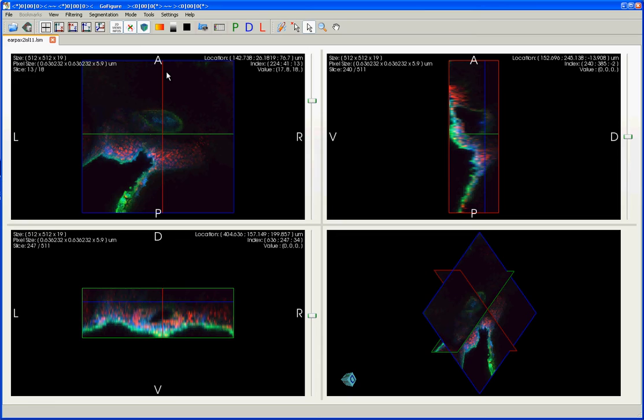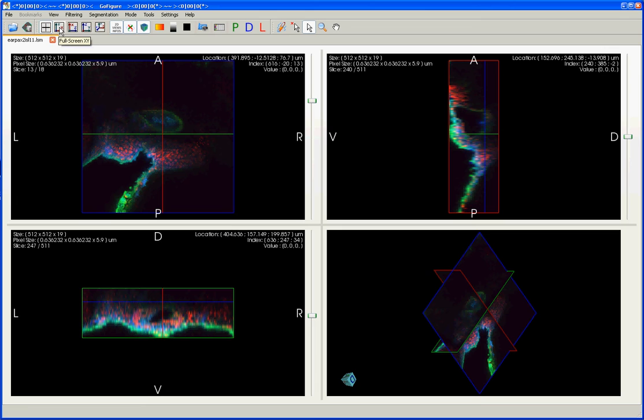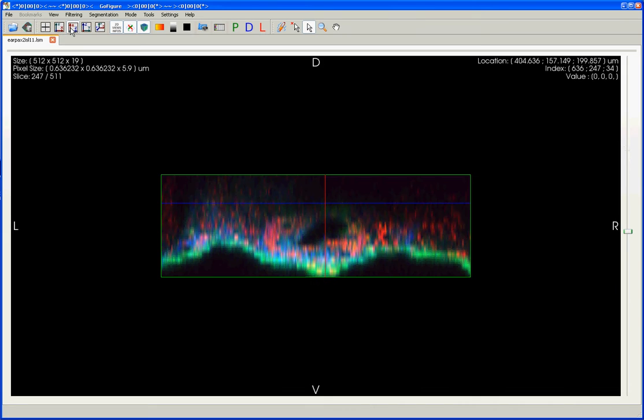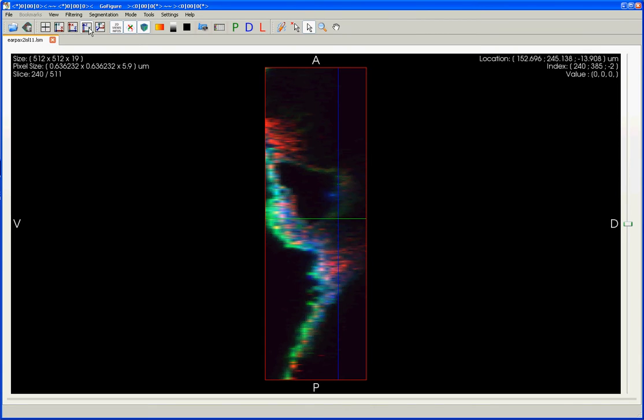While I often find it useful to navigate through my images in this quad view, depending on what feature you might want to focus on, it's sometimes useful to look at just one of these views at a time. And that's what these buttons up here are for. So to make just the XY plane the full screen, you can click on this button, and you can do the same thing for each of the other views or the 3D view.